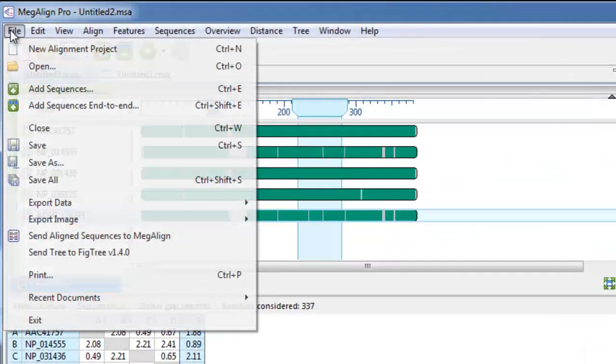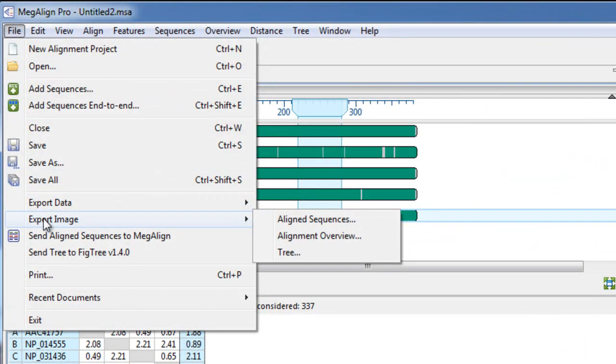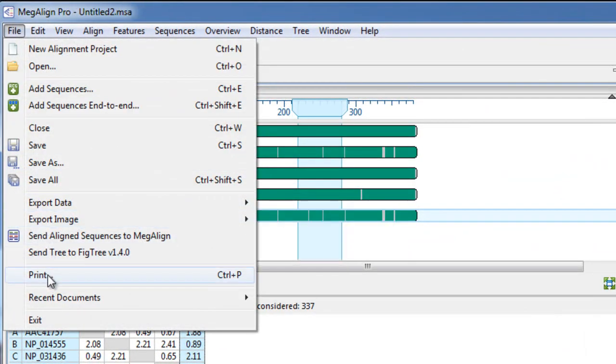Finally, you can choose to export or print any of the images that you create here in Megaline Pro for use in your publications.